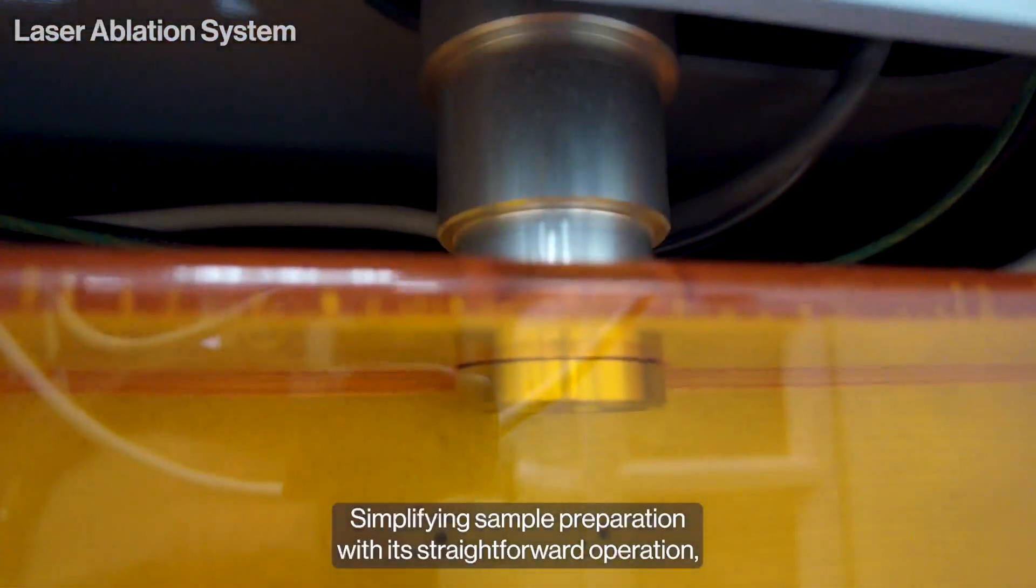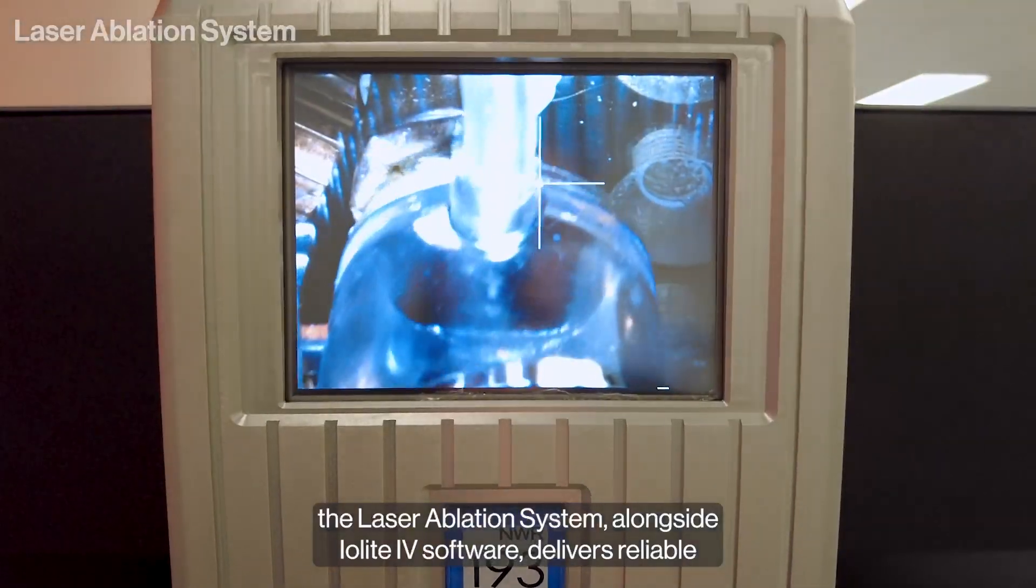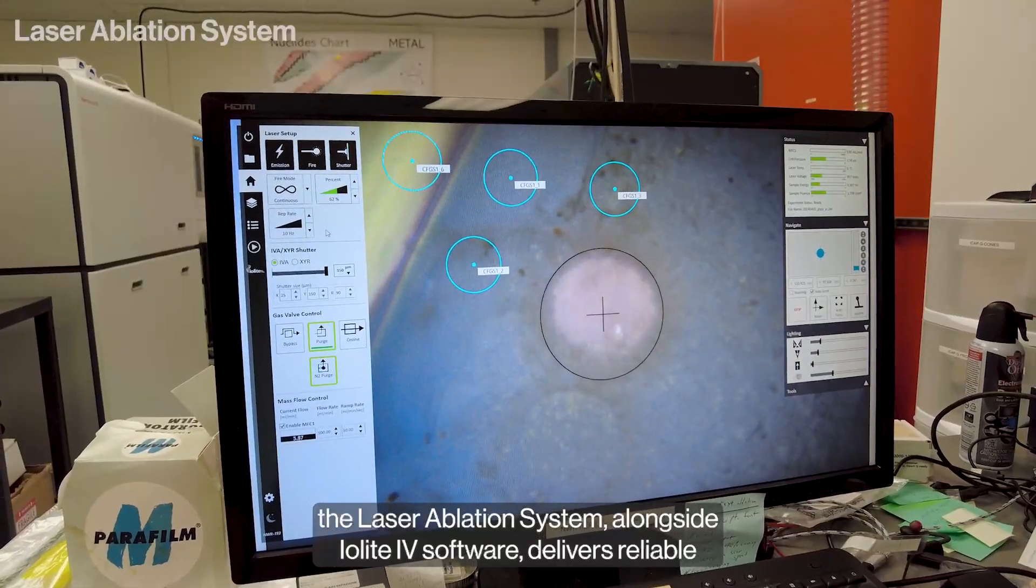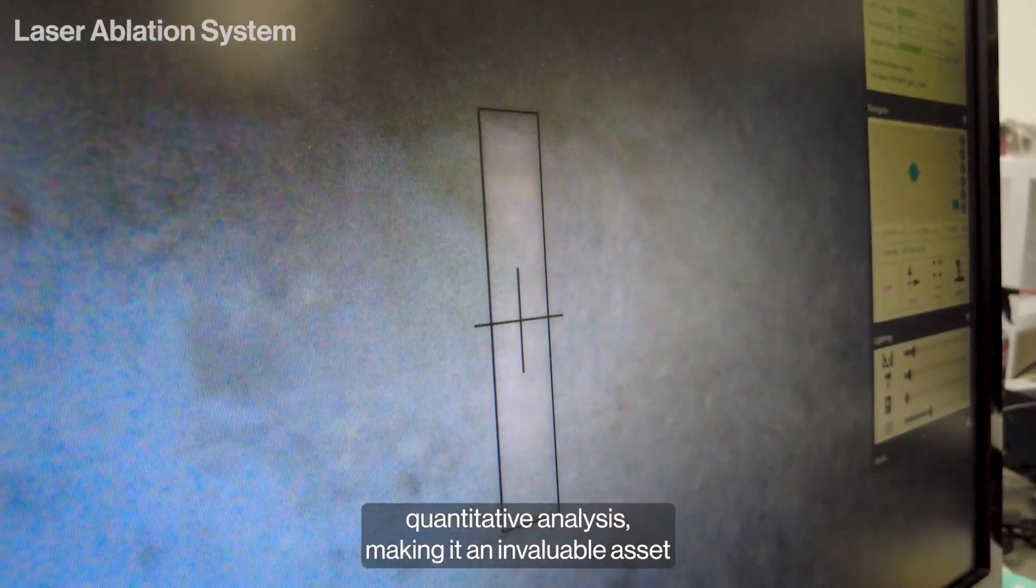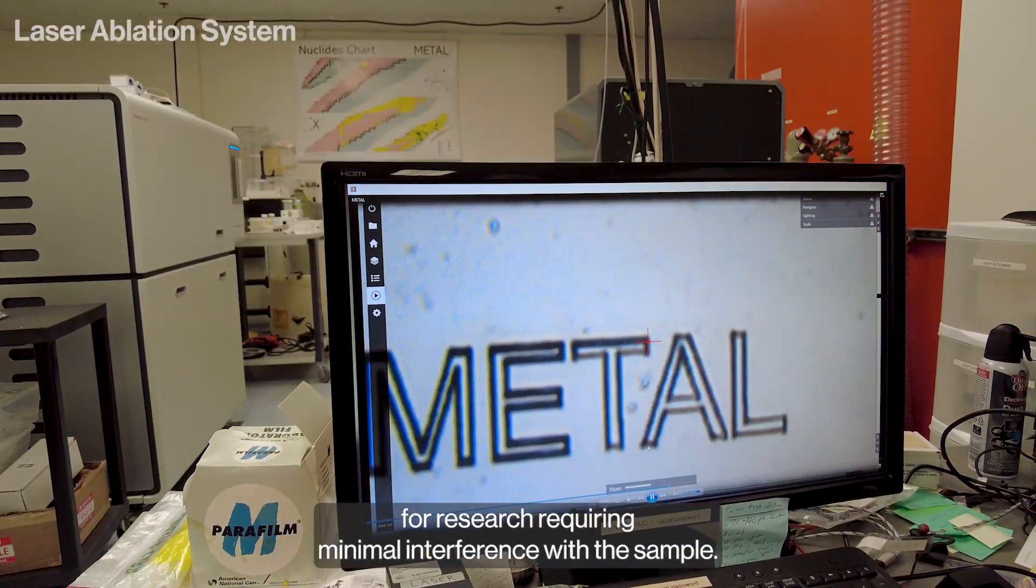Simplifying sample preparation with its straightforward operation, the laser ablation system, alongside IOLITE-4 software, delivers reliable, quantitative analysis, making it an invaluable asset for research, requiring minimal interference with the sample.